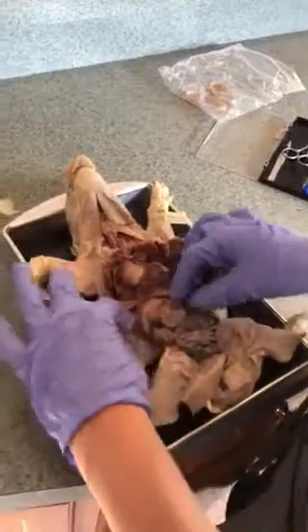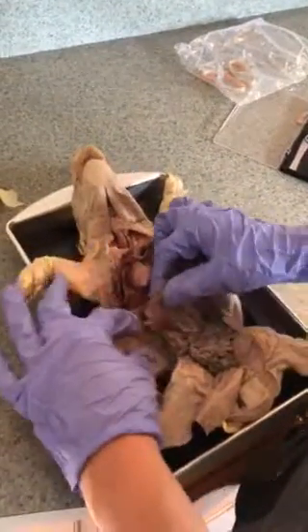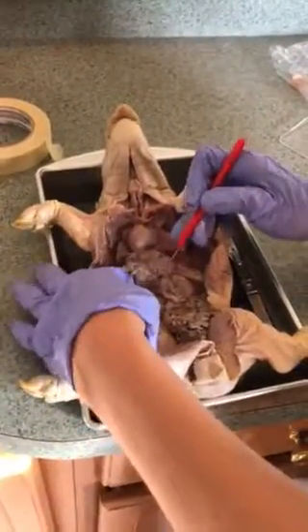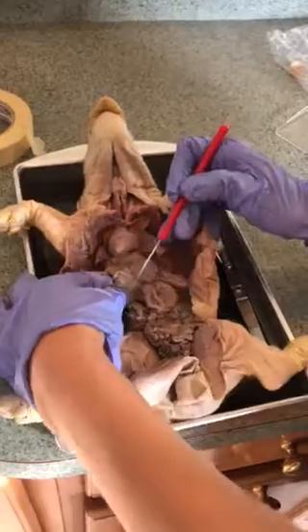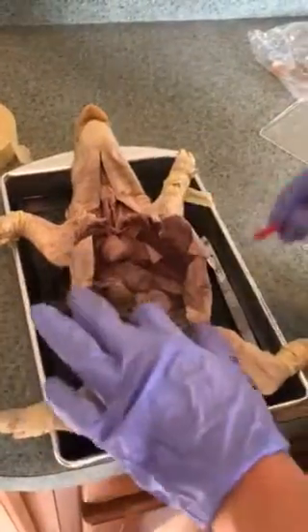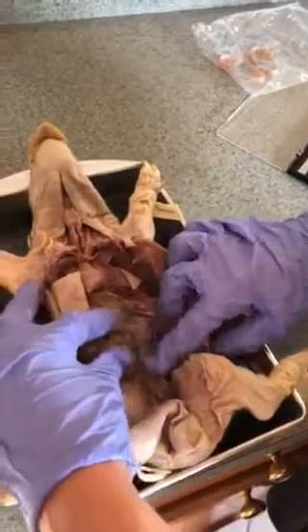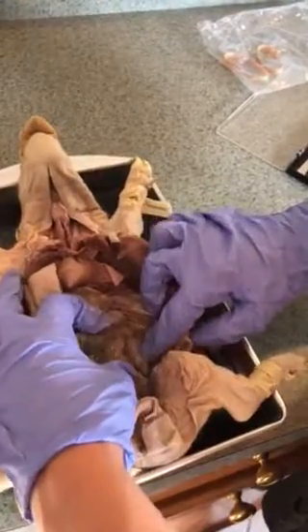So the first on my list is the gallbladder. So that is this right here. That looks like a little green pea. That's the gallbladder. Then we have the kidneys, which one of the kidneys is back here.